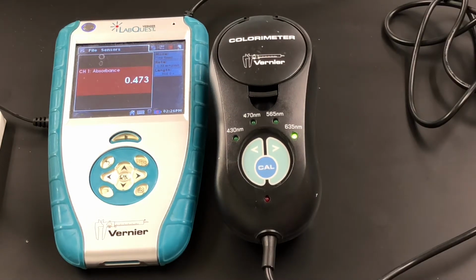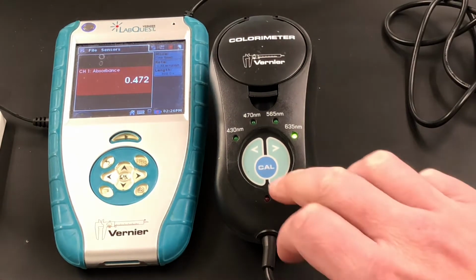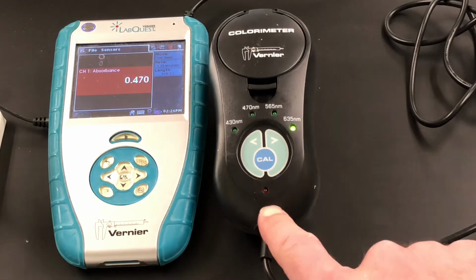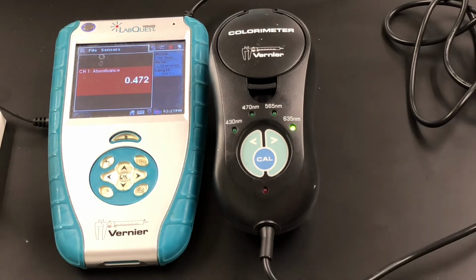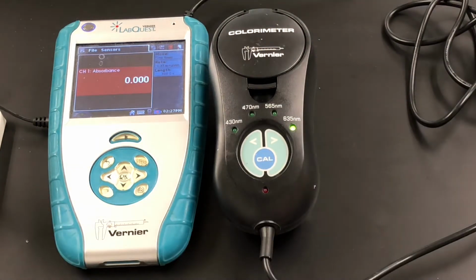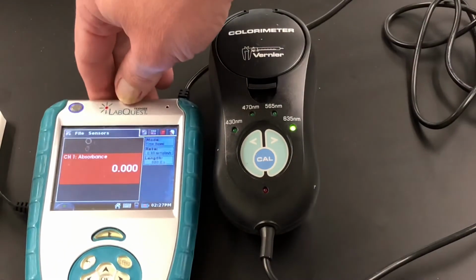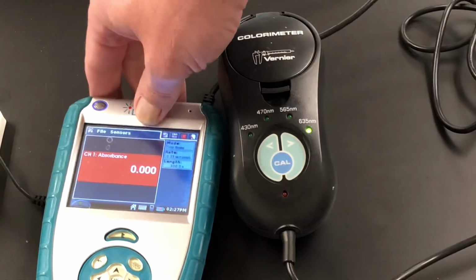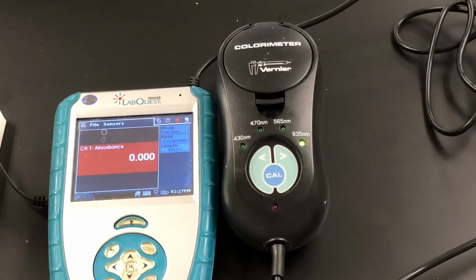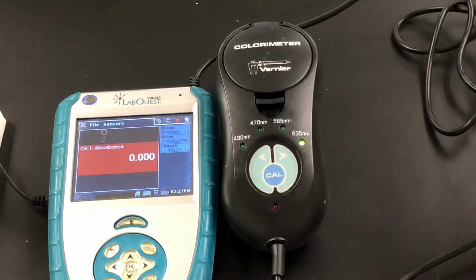Once we do this, we should only ever do it once. There we go, we're flashing. Hopefully we'll zero out here. There we go, we see that our absorbance has gone to 0. This way, it's not taking into account any of the absorbances inside the machine from the things that the light's passing through, the water, etc.